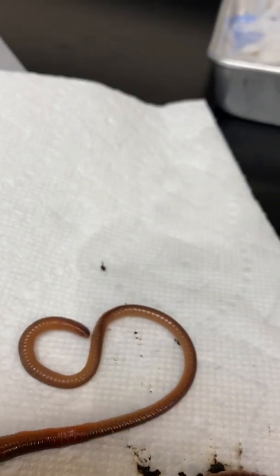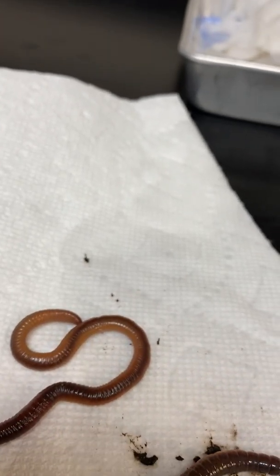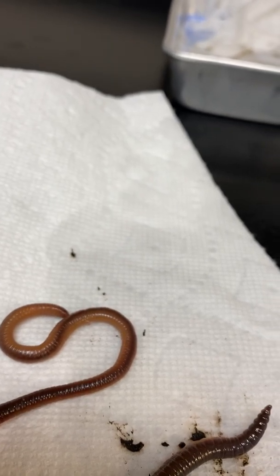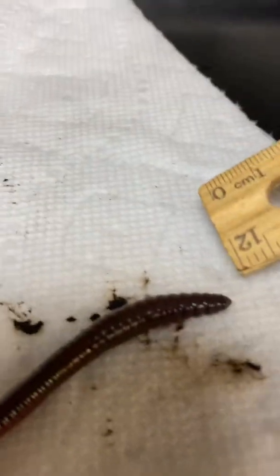And the last question, 35. Each body segment is called a metamere. As best as you can, count and record the number of segments, metameres, not including the clitellum of your earthworm. In the notes, it said there's over 100 segments. Let's try to count the number of segments from the front end, the anterior end, up until the clitellum. So I'm going to try my best. So the very first one is the prostomium.